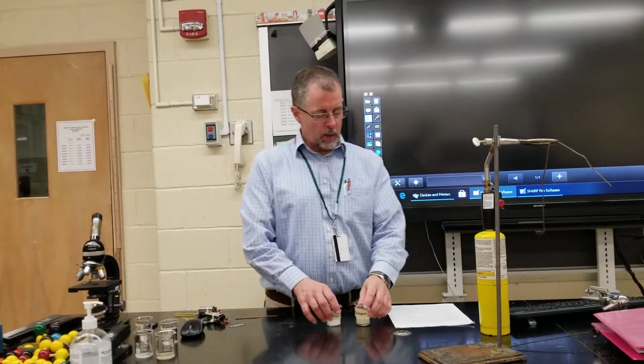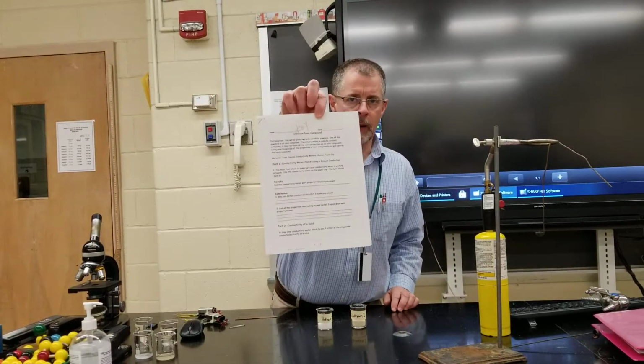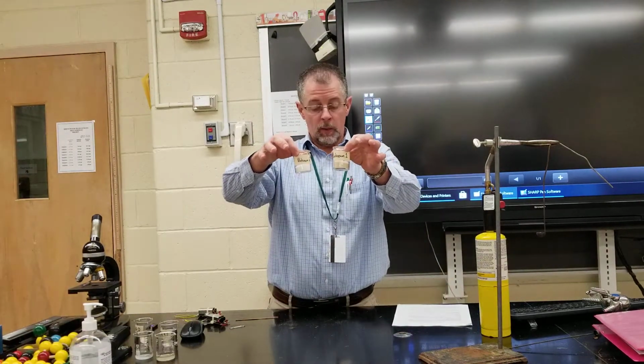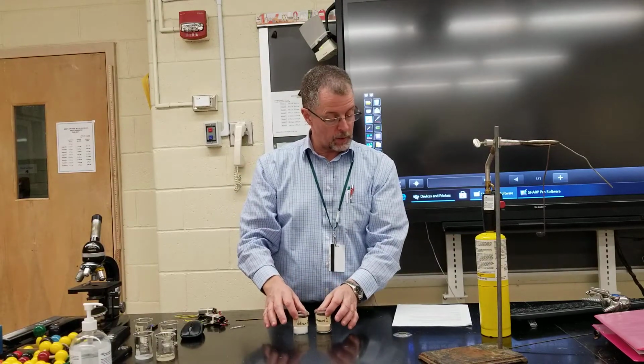Okay, good morning. So today we're going to work on the unknown ionic compound lab. For this lab, we have two unknowns, unknown 1 and unknown 2. And the goal of this lab, of course, is to figure out which one of them is ionic. So we're going to do a series of tests on them.